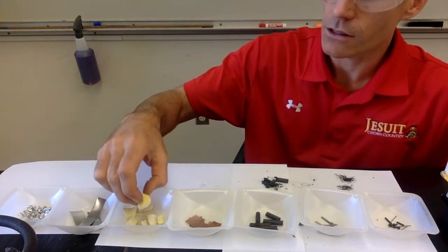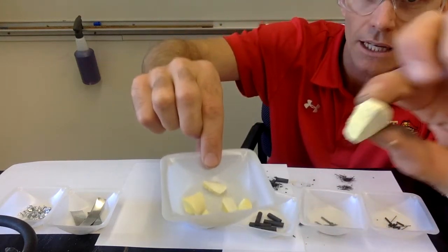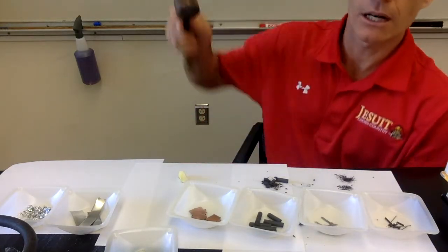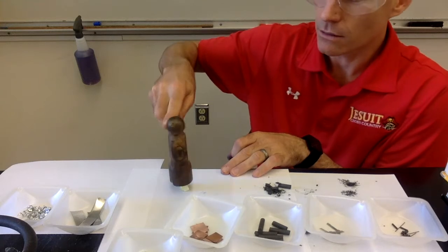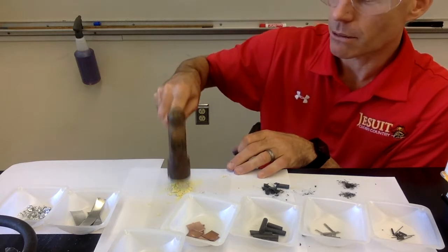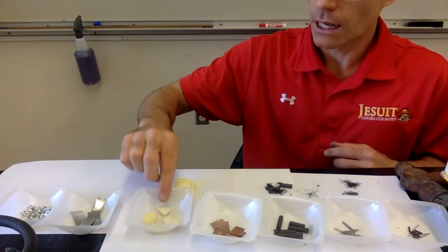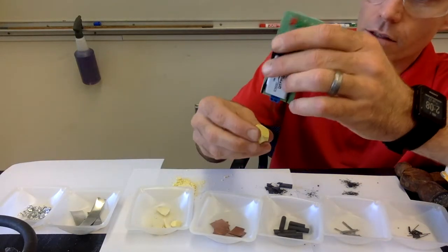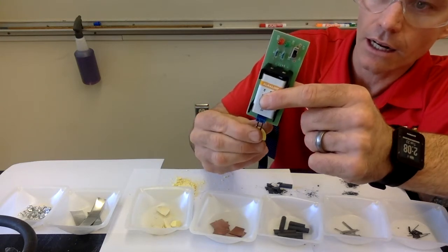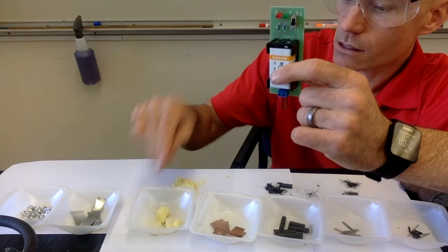Substance E. So this is substance E. You can look at the appearance of substance E and record that in your data table, just what it looks like. And we'll do the crushing test with the hammer. So here's our hammer on substance E. Okay, so that breaks apart into a powder fairly easily without too much force. We'll now check the conductivity of substance E. So this is E. We'll get it in contact with the conductivity tester. And this one is not conducting electricity, so the light does not turn on with substance E. So electricity cannot pass through this material.